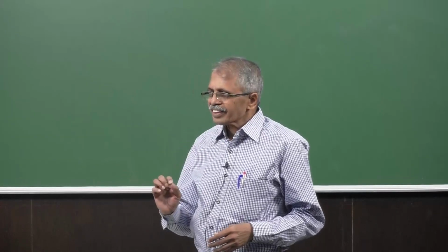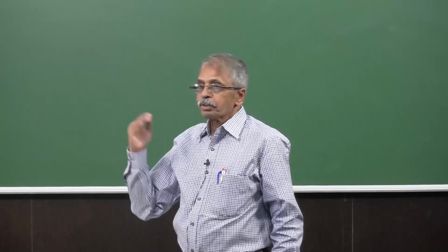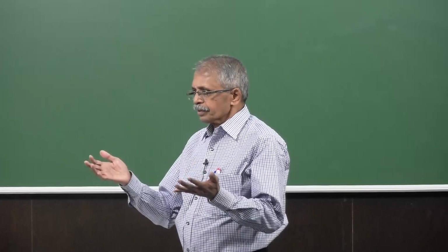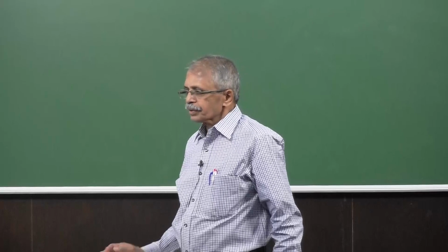So to give a little extended flavor of what we talked about, I again draw your attention to these micrographs, again transmission electron micrographs. You start seeing something more than what you have seen earlier. You have spheres here, you can see. Of course, the contrast is taken differently, which I explained to you earlier, dark field and bright field. So based on that, you can see the picture with the main object dark and the rest gray, or the reverse, where the main object is gray and the rest is dark. Those kinds of things we already have looked at.